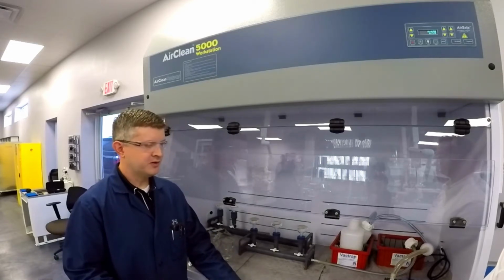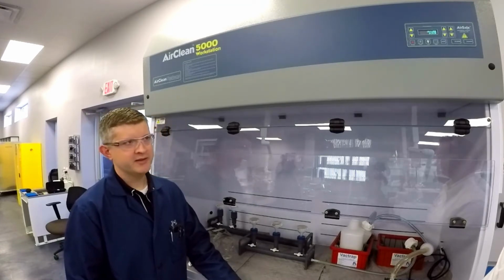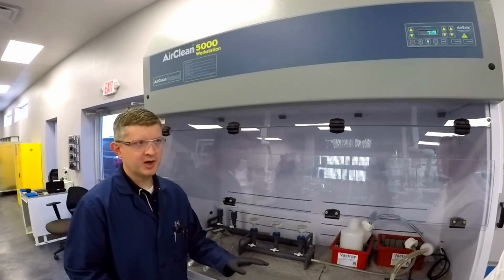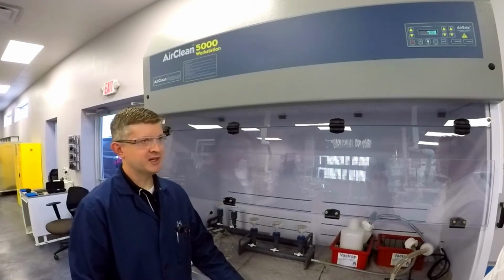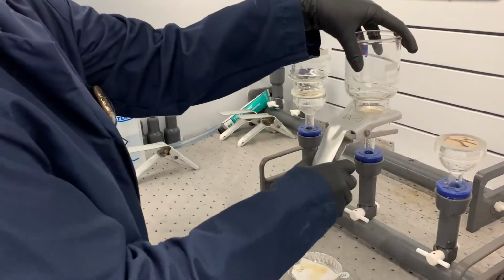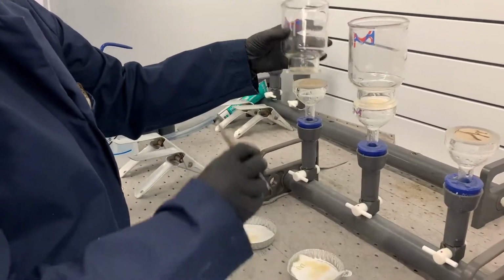The next step we do is an acetic acid step. We'll dry it and weigh it. That's going to take care of your carbonates, your calcium carbonates, your magnesium carbonates. Then the next step is going to be a 15% hydrochloric acid, so dry and weigh. That's going to take care of your iron oxides, your iron sulfides.